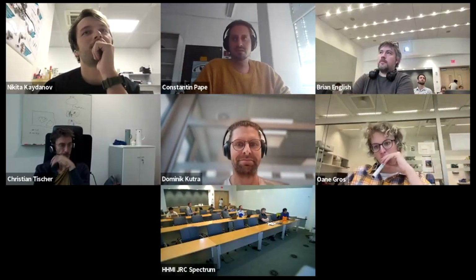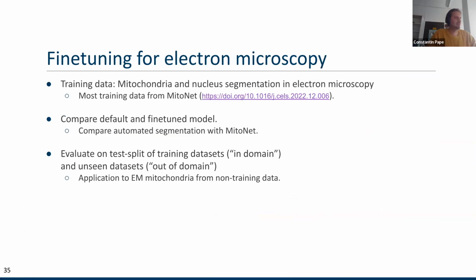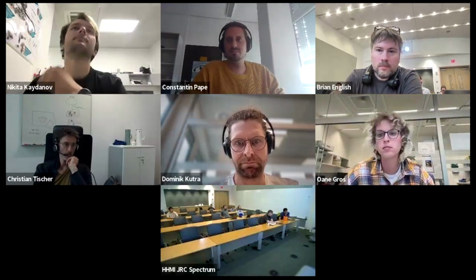Are the results similar for EM? It works better for EM if you have things like mitos, so that we also had here. So this was the result for mitos, again for this mask approach. And it's not perfect, but it's much better in actually finding mitochondria than it was before to find cells. But the inefficiency, of course, stays. Yeah. Got it. Thank you.